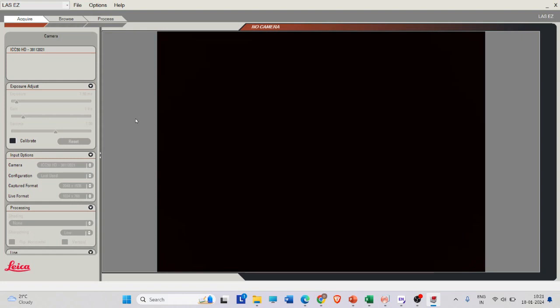Once that normal electromagnetic light wave gets converted into a polarized light wave, it will interact with your sample over here, and it will enter this objective lens, and after that this analyzer will come into the picture.